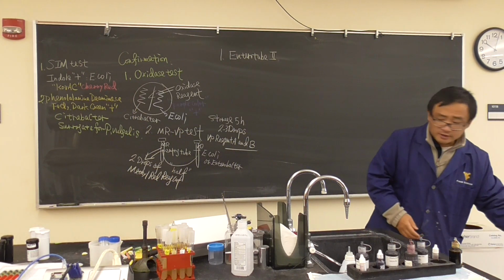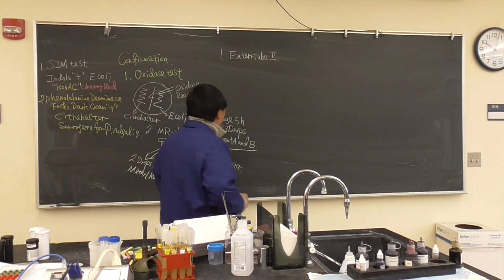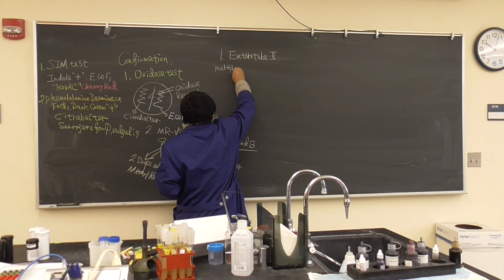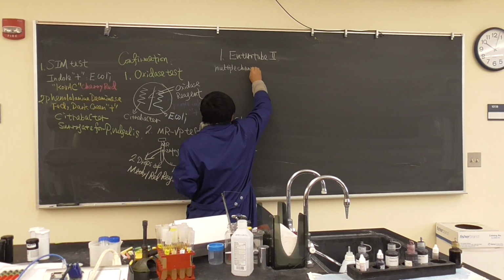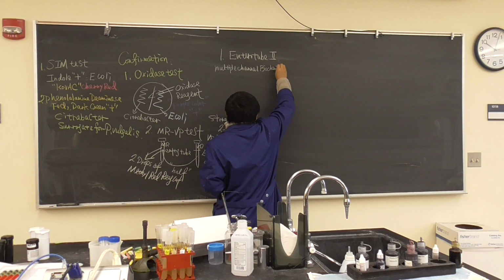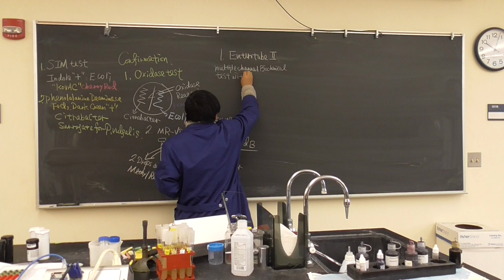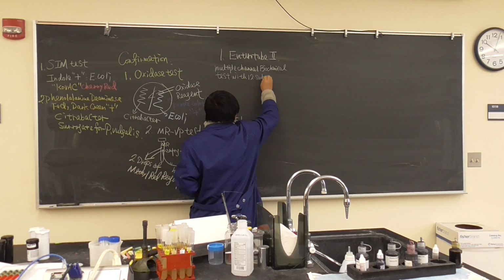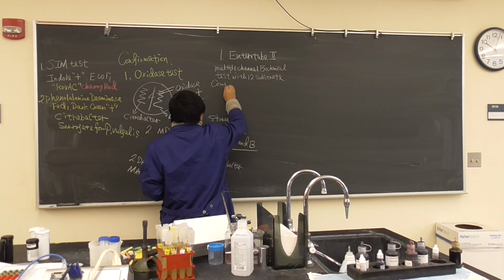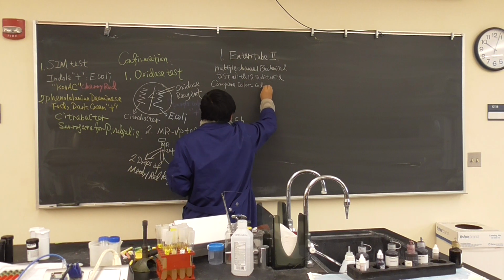Now, the remaining question is why we need to use this. This is a multiple-channel biochemistry test with 12 substrates, and you compare the color code to the code book.